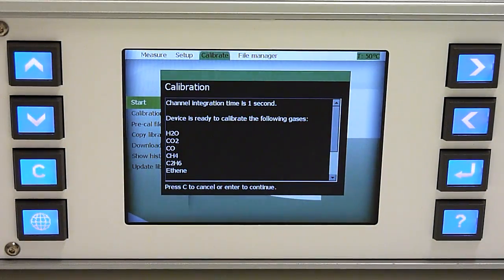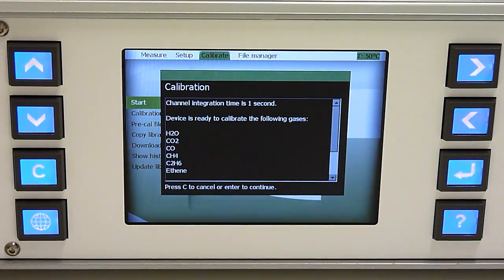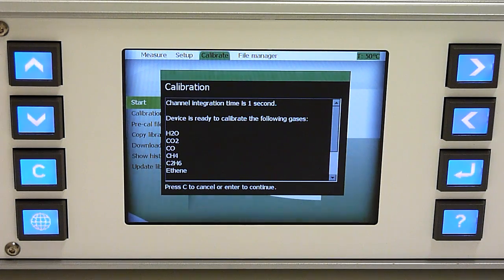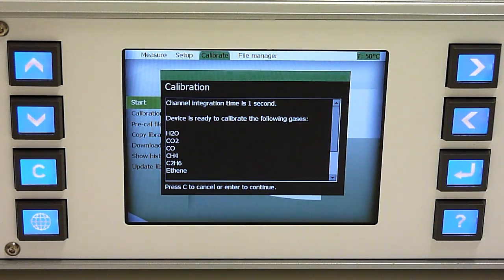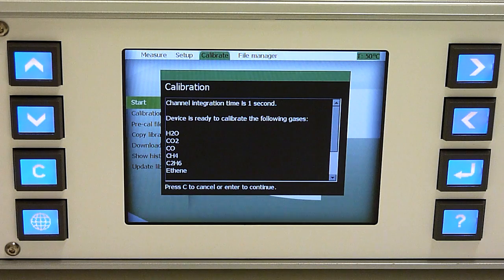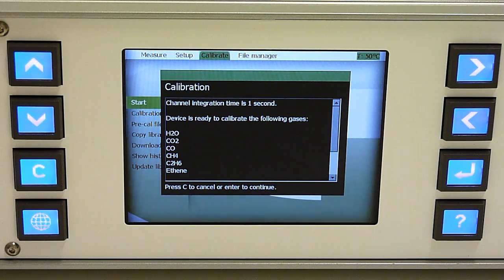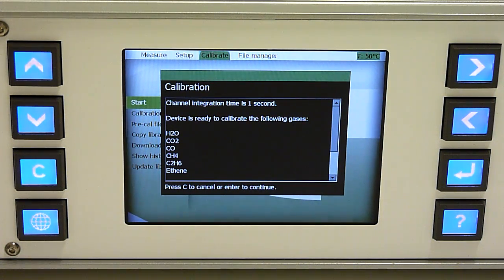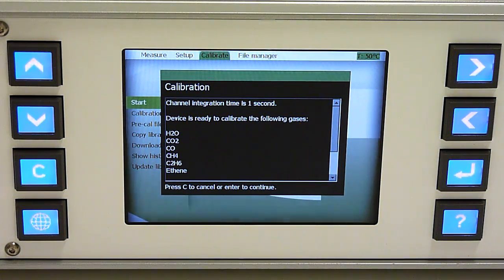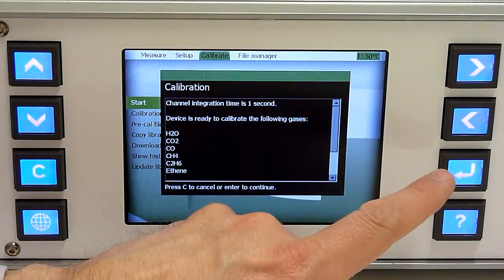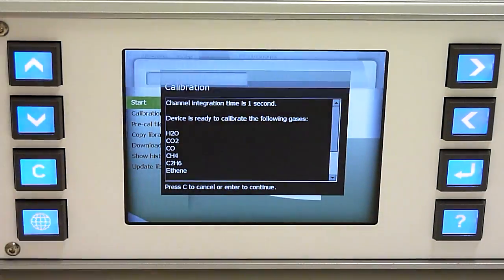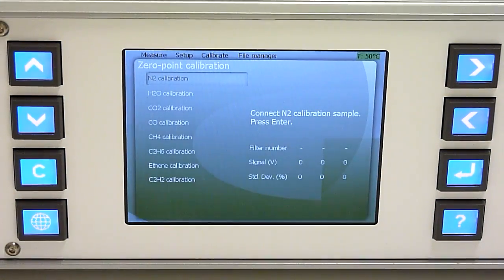If you start your calibration task, the instrument first shows you which gases can be calibrated, meaning which gases you have filters for and you have the pre-calibration files. If you proceed, you have an option to calibrate the background or any of the other gases.